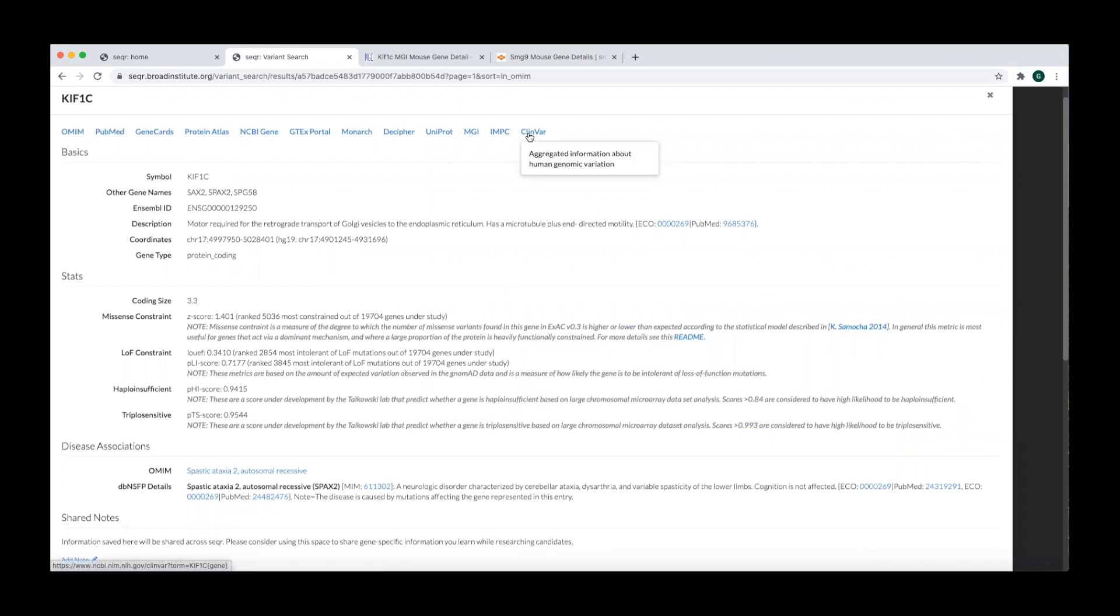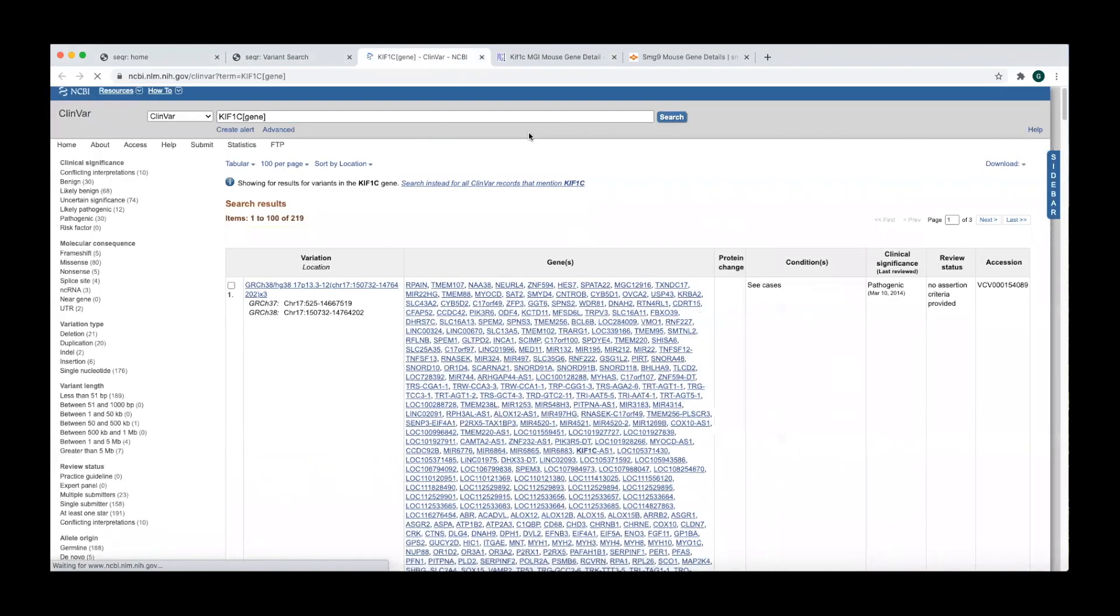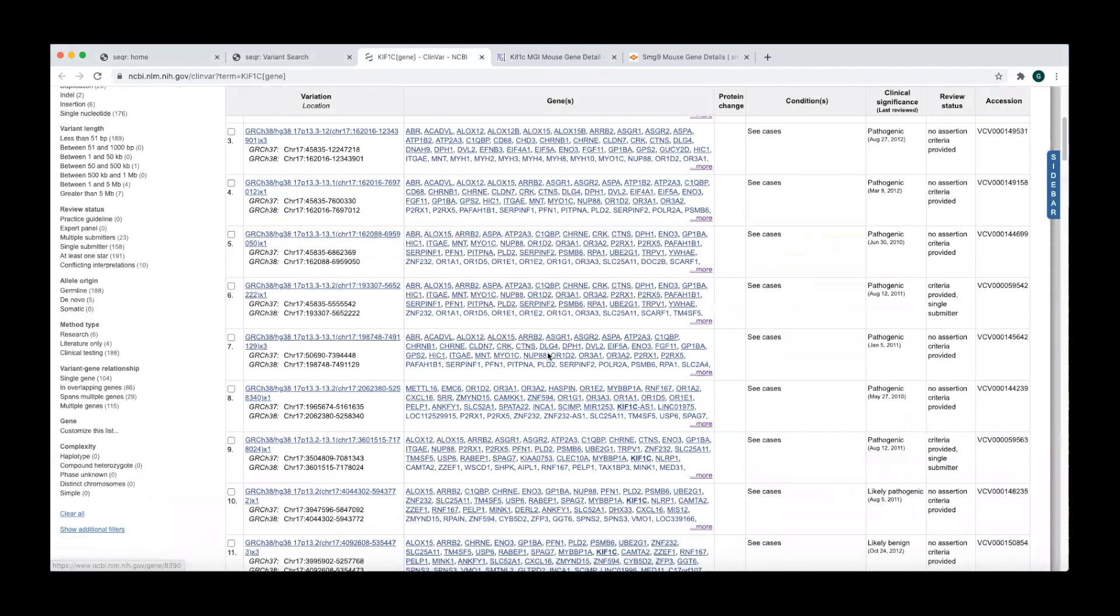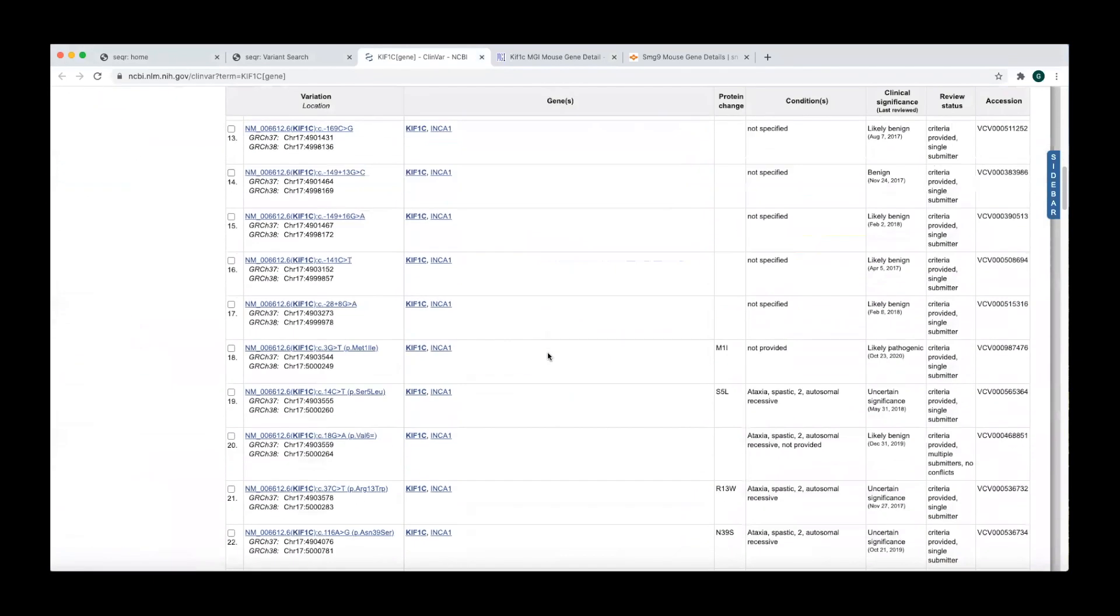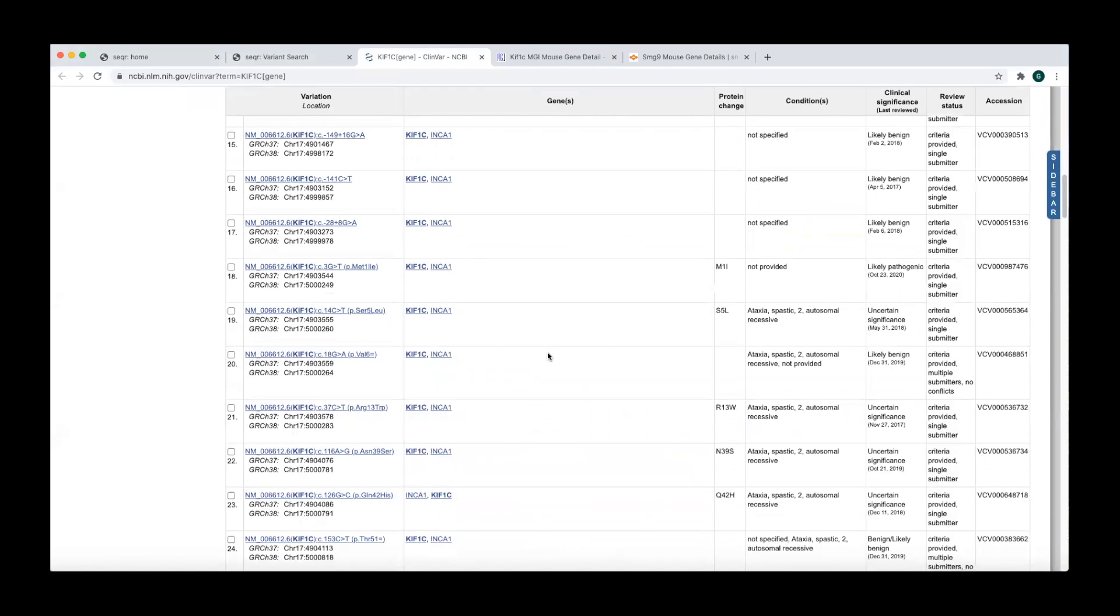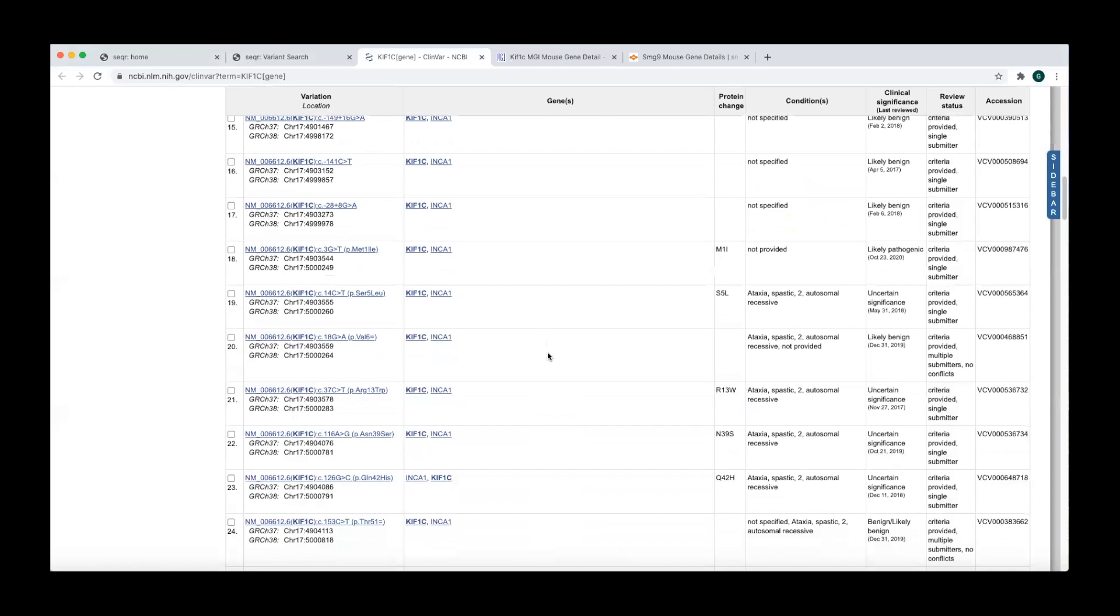Clicking on the ClinVar link will bring you to a list of all ClinVar variant submissions associated with the gene. A variant is only noted in Seqr to be in ClinVar if the exact nucleotide change is in ClinVar, so it can be worth reviewing if there are other similar or nearby pathogenic variants.